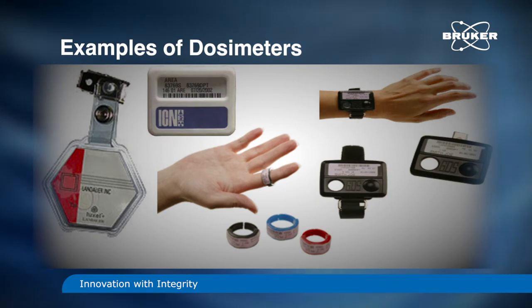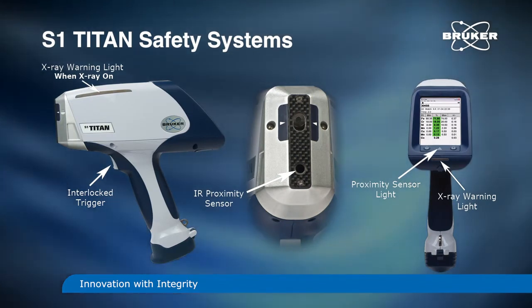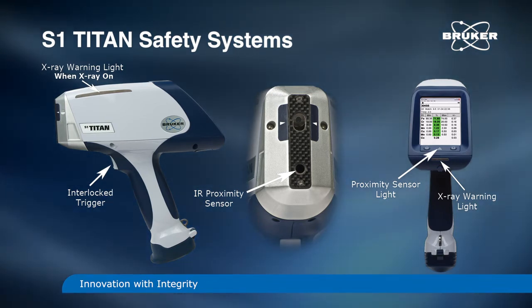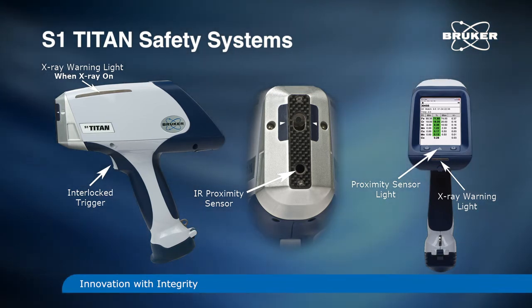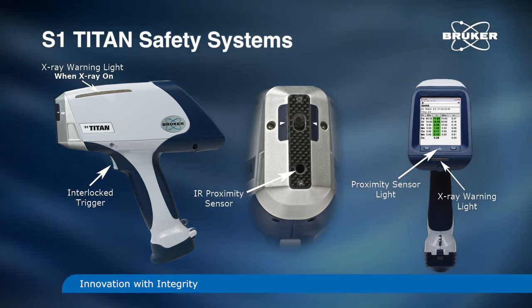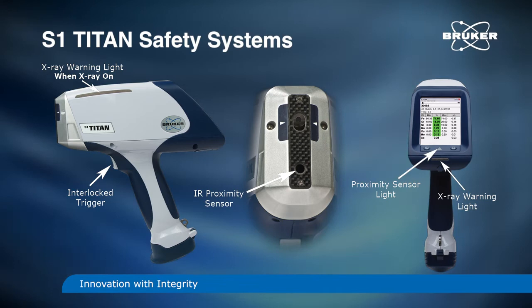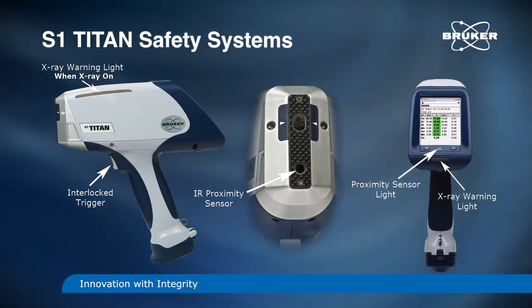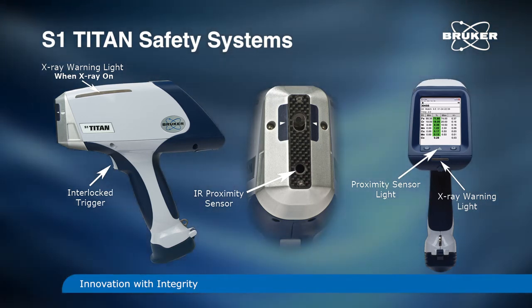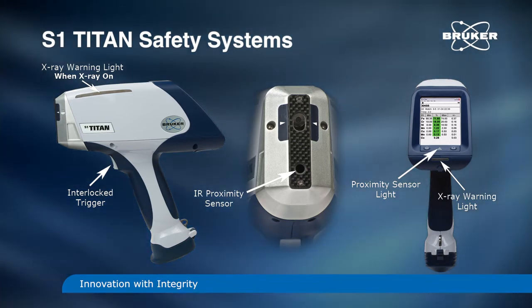Starting at the left and moving clockwise, they are the optically stimulated luminescent or OSL dosimeter, the film badge, wrist dosimeters, and finger rings. Bruker designs fail-safe systems and interlocks into devices to prevent unauthorized or unsafe use of the analyzer. These include password protection, software X-ray warning, infrared IR proximity sensor, operator trigger interlock, red X-ray warning light, minimum backscatter detection, X-ray annunciator, and operator timeout.